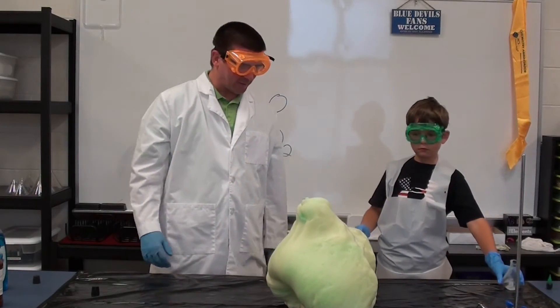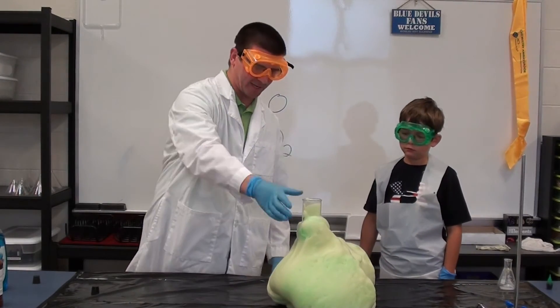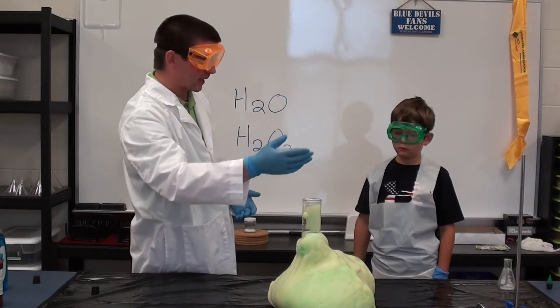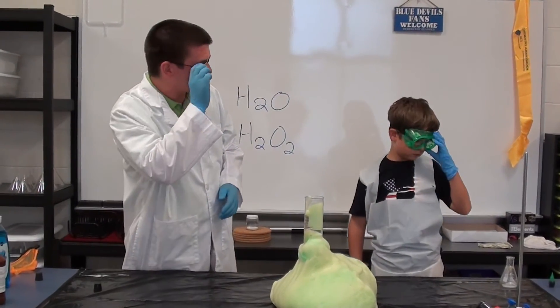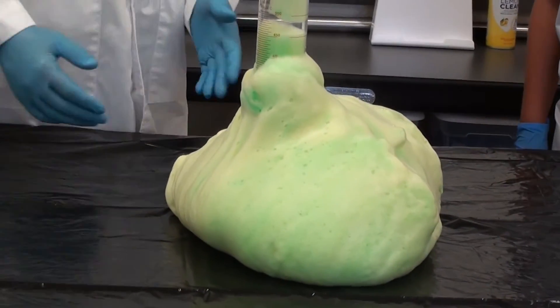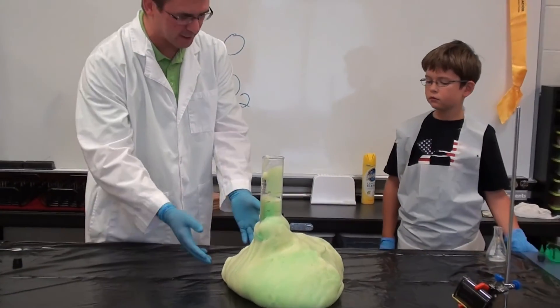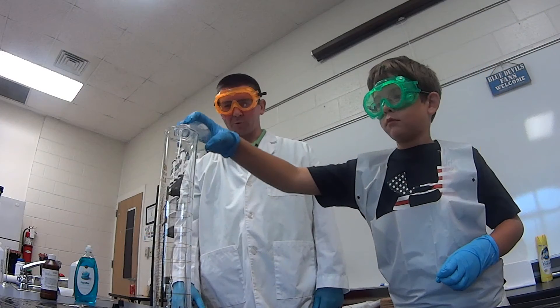All right, so what we have — you see it foams up, right? It comes out. A lot of people call it elephant toothpaste because when it comes out it kind of looks like toothpaste being squirted out of a tube. And now we've got this nice foam. You see it's giving off steam here — it's actually steaming because the reaction is exothermic, which means it gives off heat. As those react, it causes the peroxide to release the oxygen gas, and the dish detergent catches those oxygen bubbles and gives us this nice foamy elephant toothpaste effect.